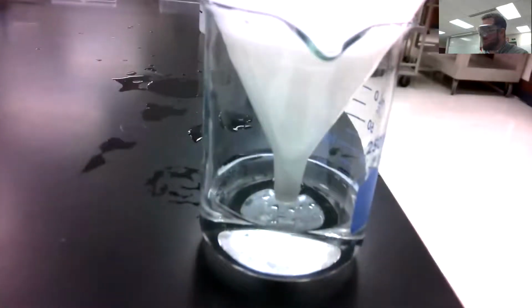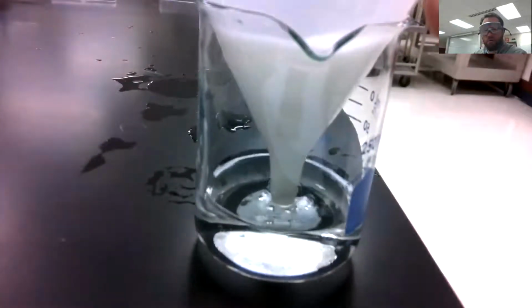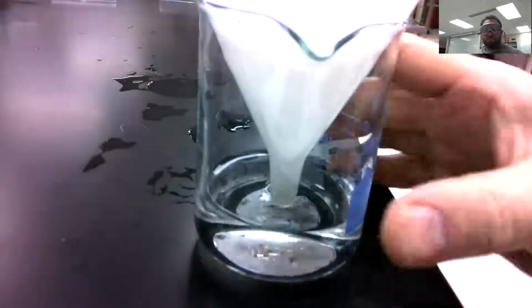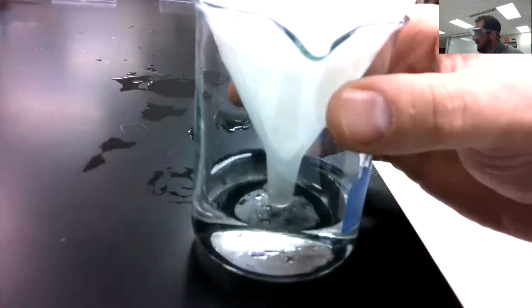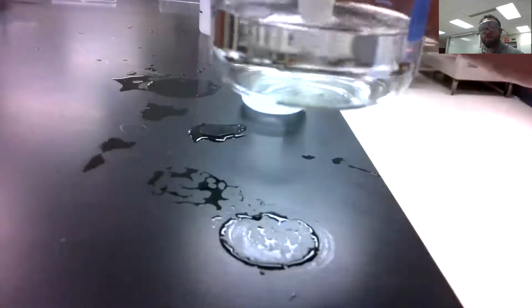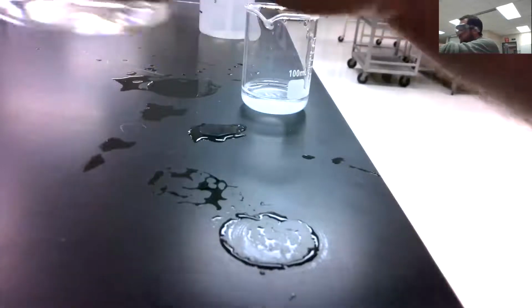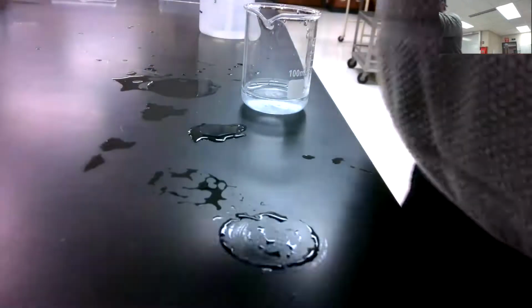At this point, you guys can kind of see how the funnel's starting to get covered there. Funnel's starting to dip into the water. I'm going to pour out our water. Again, I know I've done a good job because it would have that white, cloudy appearance if any of my product had gotten in there. It's still really clear. Doesn't look like there's any solids. I'm going to dump this out down the drain.